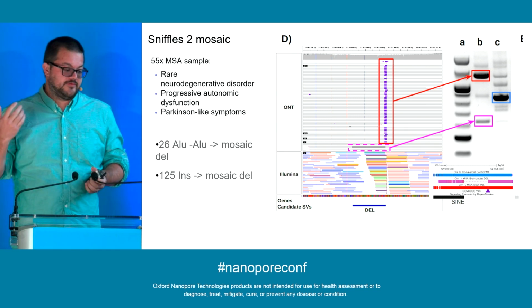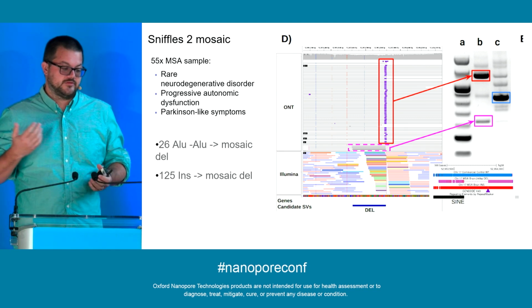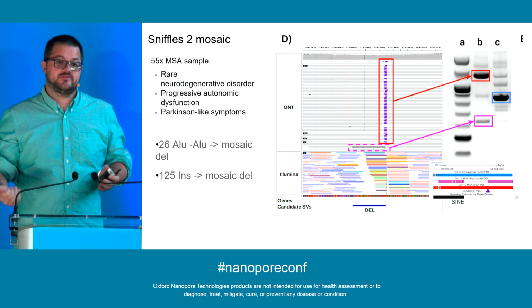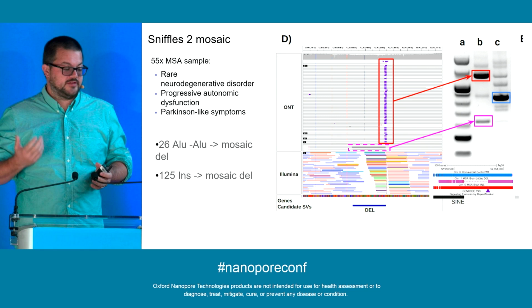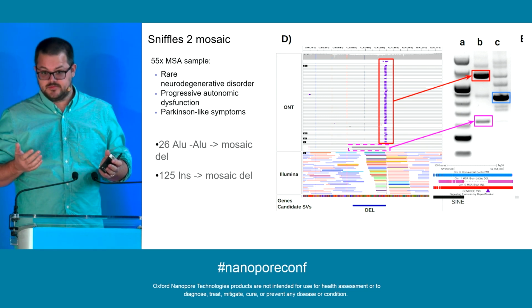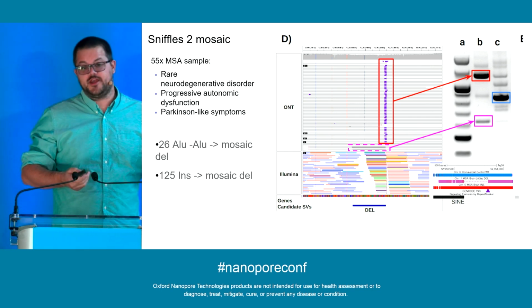For example, we have benchmarked that Sniffles currently has a precision of 85% for structural variants down to 1%, and has a recall of around 10%, so there are SVs that we are missing in these data sets. So I'm pretty happy with this.